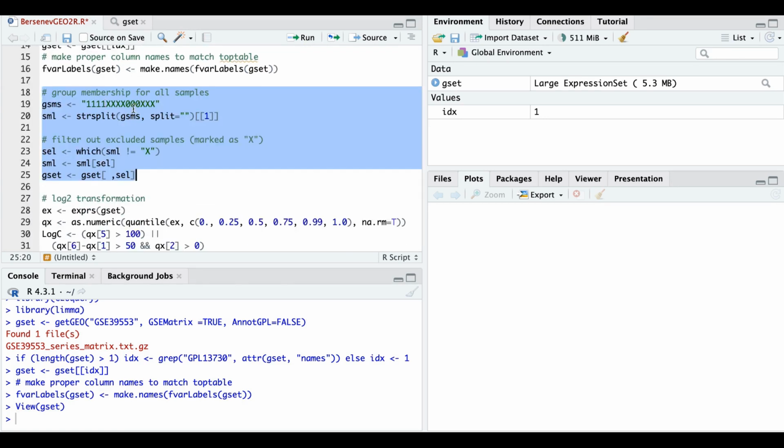What is actually happening here is the script will mark the first 4 samples, then skip another 4, then take the next 3 and skip another 3, and then all the samples which are not used will be removed, and this is not good.